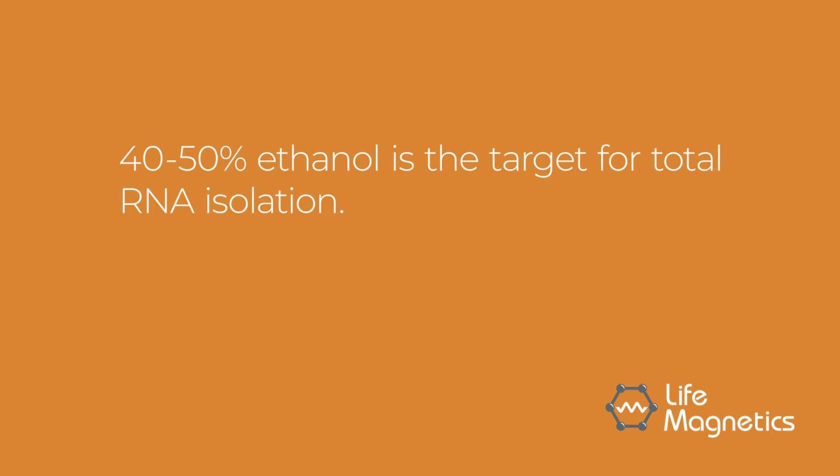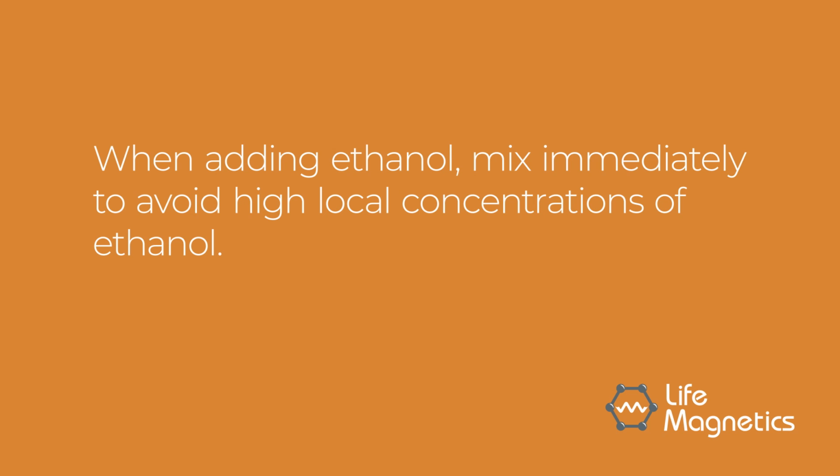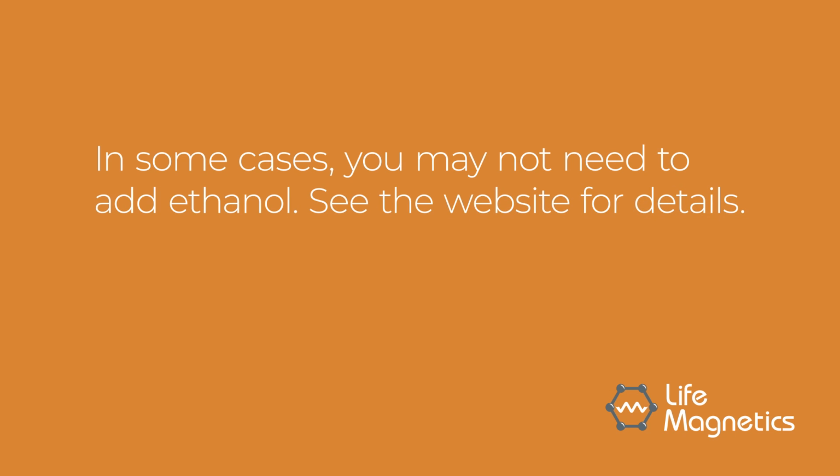40 to 50% ethanol is our target for total RNA isolation, as this fully opens up the secondary structure of RNA. When adding ethanol, mix immediately to avoid high local concentrations of ethanol. In some cases, you may not need to add ethanol at all, like if the RNA is very short and has no secondary structure. This can be leveraged for size and structure separations in some cases, but see the website for details.